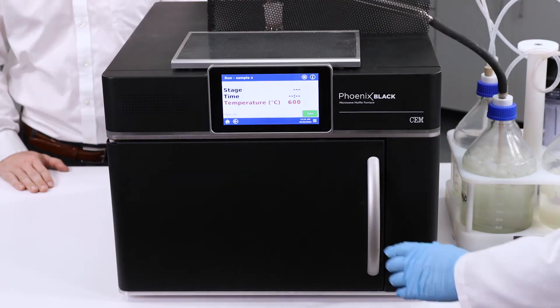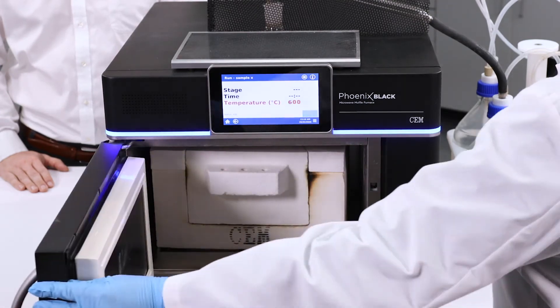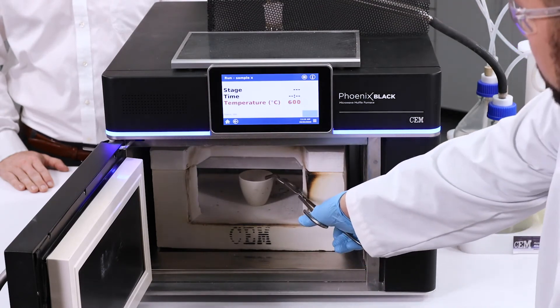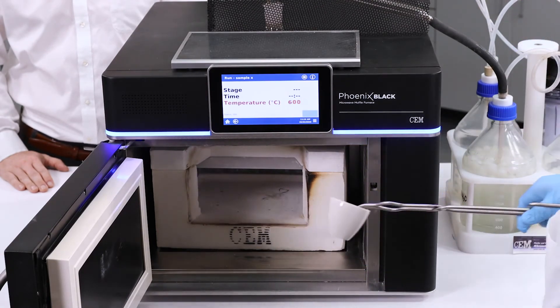Now that our method is finished and our sample is completely ashed, we can remove our sample from the Phoenix Black, put it in a desiccator to cool, and then re-weigh.